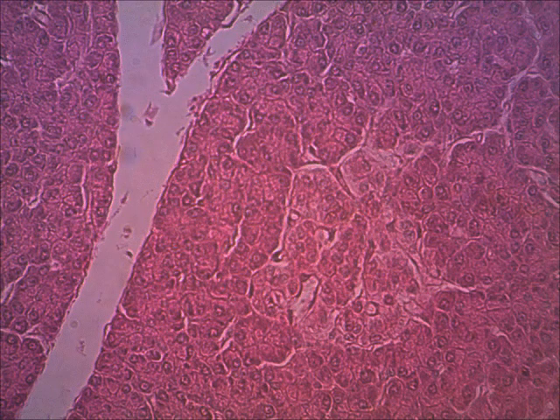Here it is on even higher power, and I'll circle. See if you can find an islet of Langerhans there. There's one. Now I'll draw a circle around it. Here we go. It just looks a little bit different than the other clusters. These other areas, I'll draw circles around.